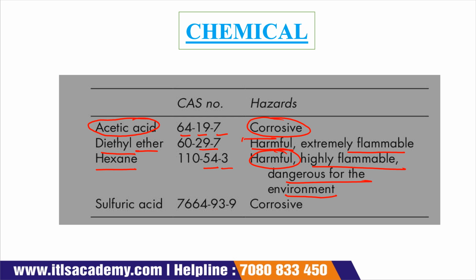What does this word harmful mean? See, harmful is related to animals and human beings. So if human beings come in contact with this chemical, then it will harm their health, or if animals come in contact with this chemical, it will also harm the animal.